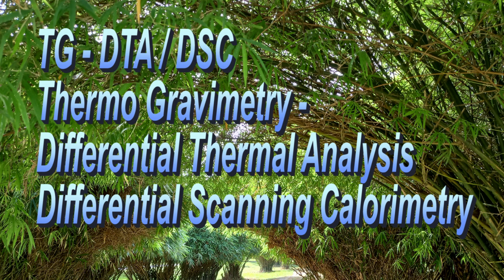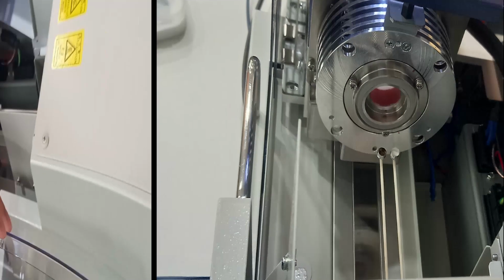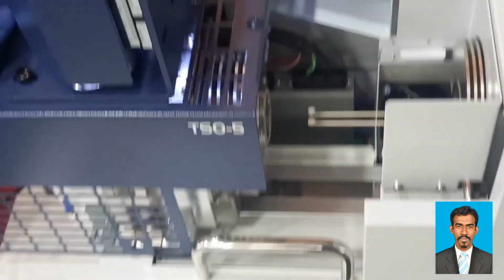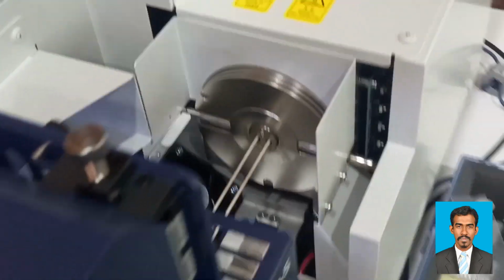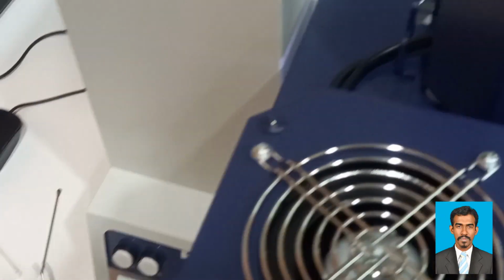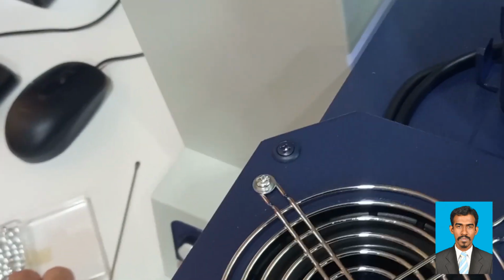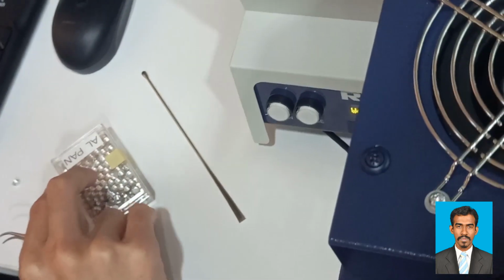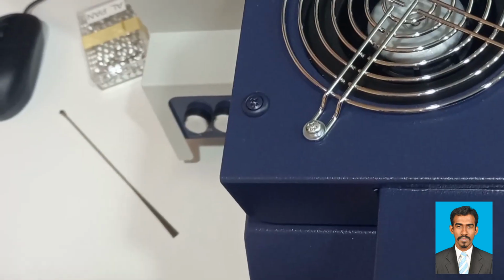TG-DTA, thermogravimetric analysis combined with differential thermal analysis, is a technique used to study the thermal behavior of materials. It provides information about the changes in a sample's weight and temperature as a function of time when subjected to controlled heating or cooling. In this technique, we can see the change in the material or sample with time by a camera fixed on the instrument.